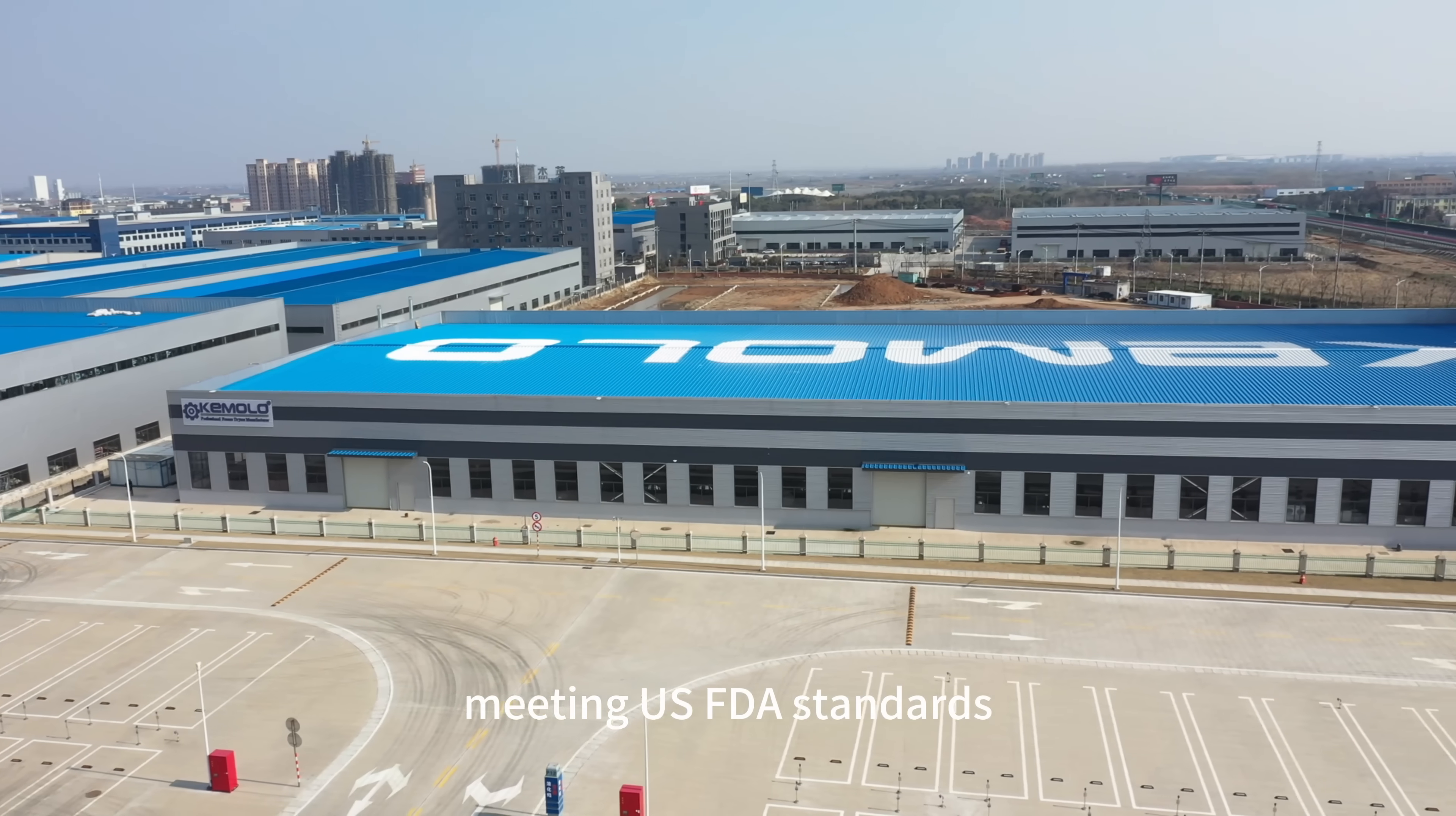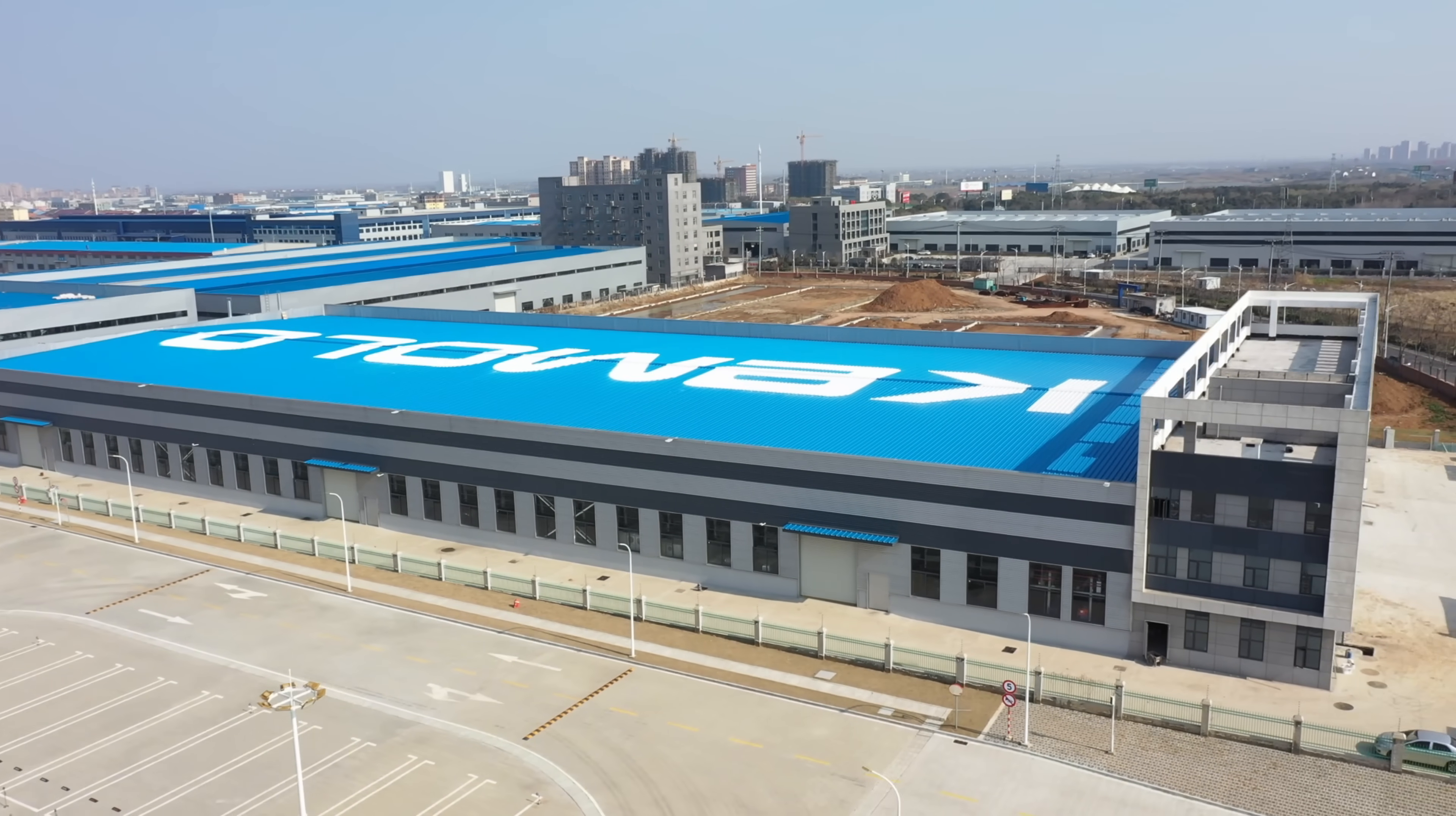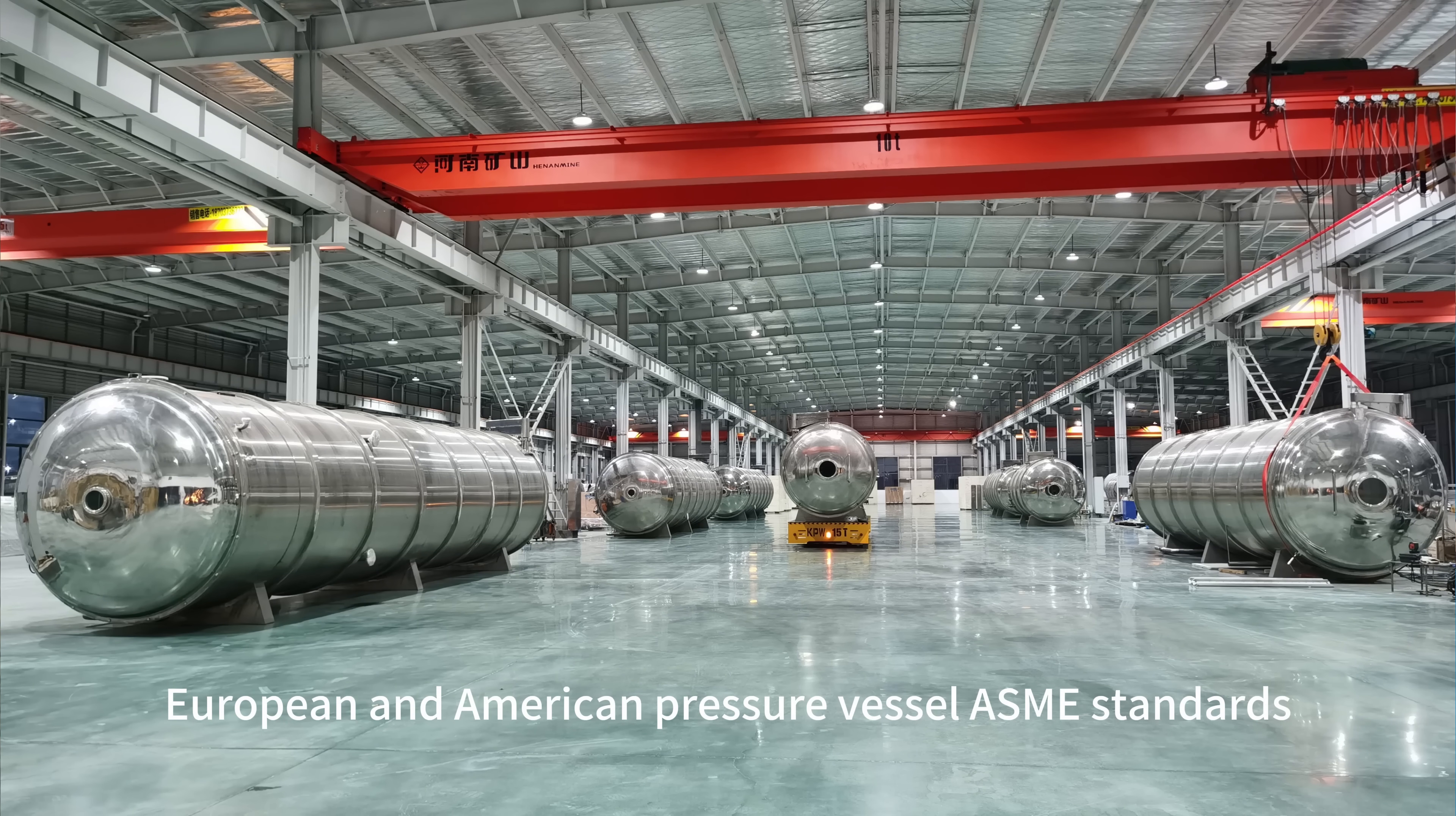Meeting U.S. FDA standards, EU CE standards, CIS EAC standards, and European and American Pressure Vessel ASME standards.